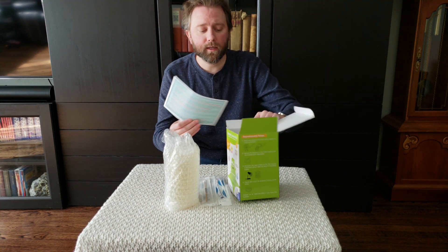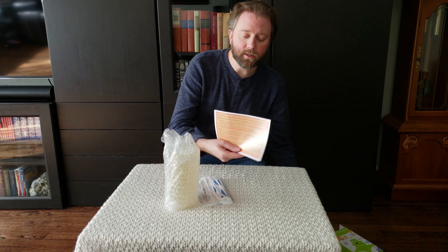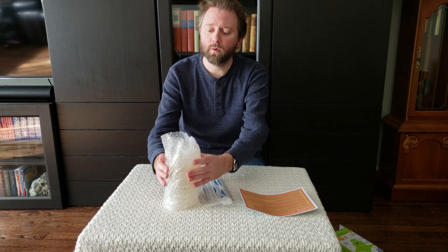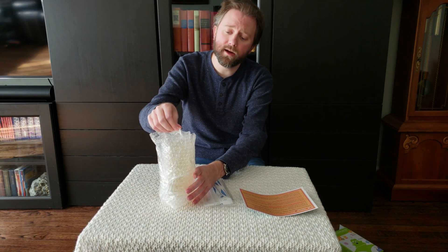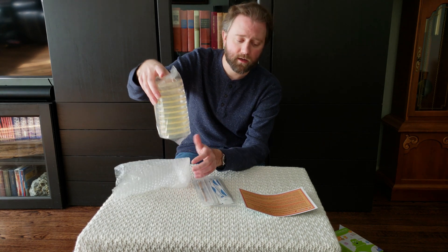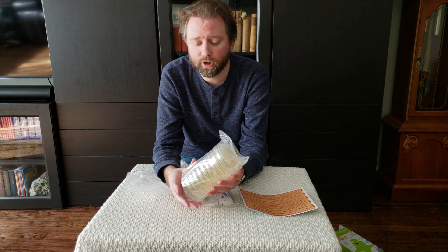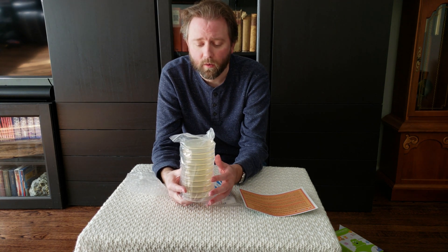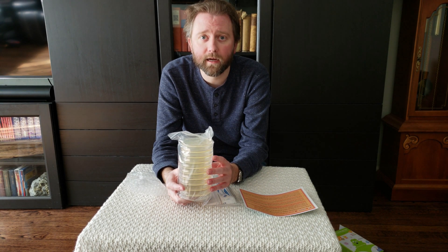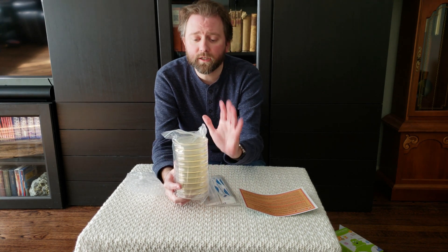Let's go ahead and open this up and show you what you get out of the kit. You get a little instruction booklet that tells you how to utilize all this stuff. I'm not going to open the bag yet because once I open it, the clock starts — I have basically 30 days to do everything. Since it's currently winter, I want to make sure I do this when it's easier to maintain that temperature range of 85 to 100 degrees.